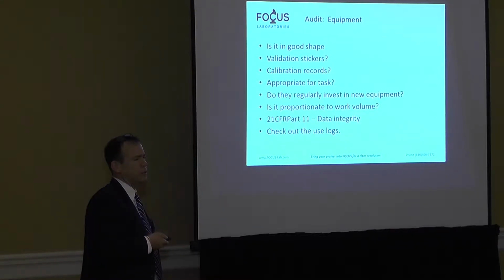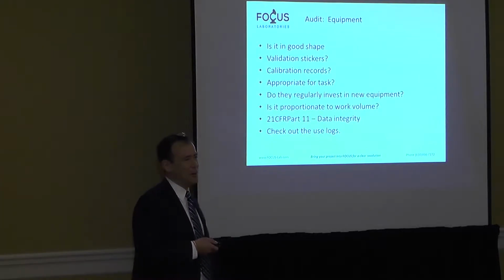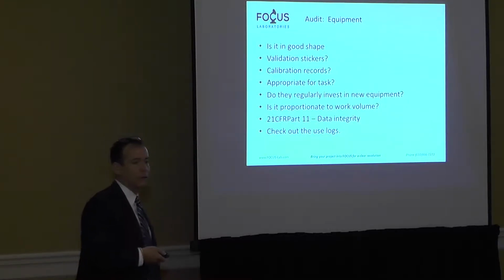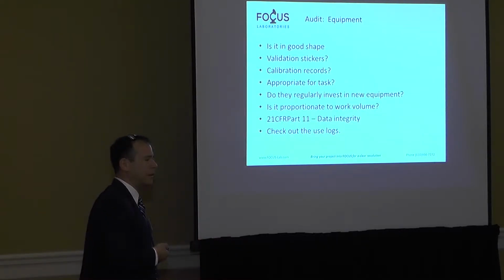Check out the use logs. This is always a very good way to determine whether or not the laboratory actually has experience in what they're talking about. A good contract testing laboratory will not put client information in the use logs. It'll be a sample number and what was tested for. So they shouldn't push back when you say, can I take a look at your use log for this HPLC? If it's dusty and hasn't been opened since 2017, 2016, they're probably not experts in that area. If it's got a lot of work in there, more than you could possibly do in an 8-hour shift, and they're not a 2-shift operation, it's another question. But it just gives you an idea of what's happening in the laboratory.